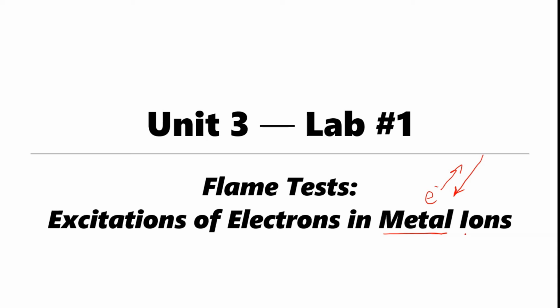And we're also going to use ions in this case just to make it a little bit easier, again for dissolving the metals. We're not taking just a solid chunk of metal. We're going to be using solutions where the metals are dissolved as ions in there.